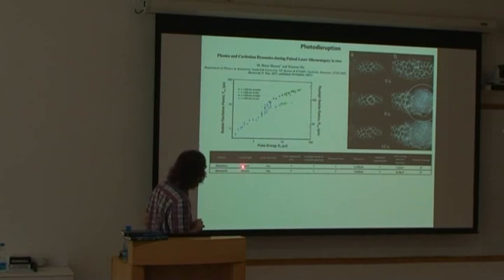So we can see that they used, in fact, for the first experiments, a 355 nanometer, which is a UV laser. And then for the second one, they used a green one. And the pulse duration was 4 nanoseconds. And here you can see the bubble oscillation period, and on the other side, the bubble radius for different cases. They did it in water, and then they also did it in the Drosophila embryo.